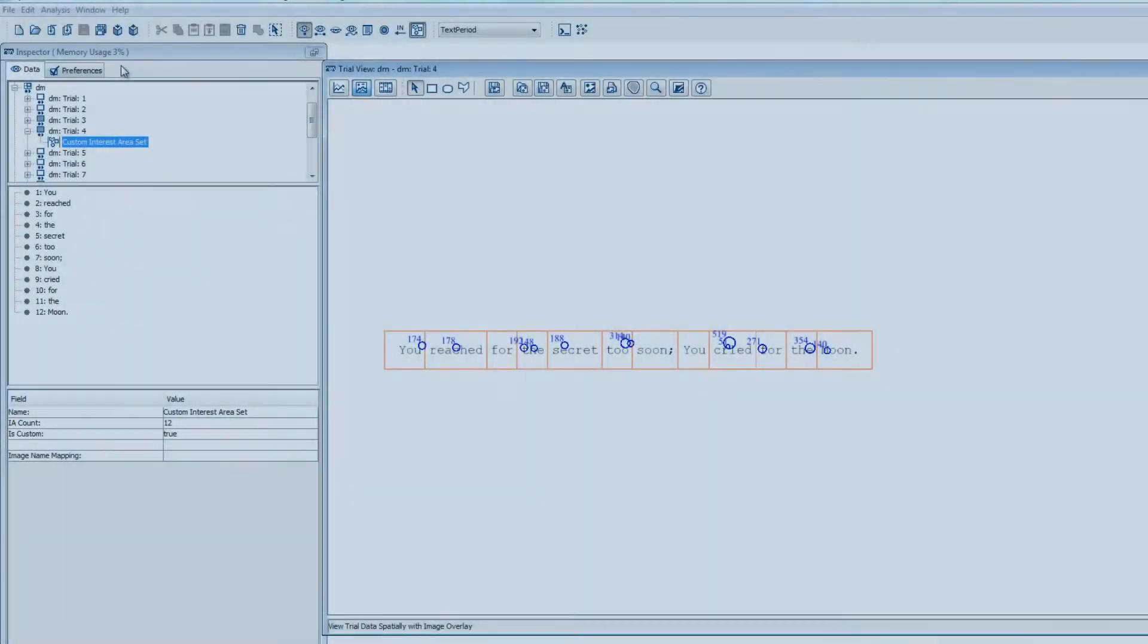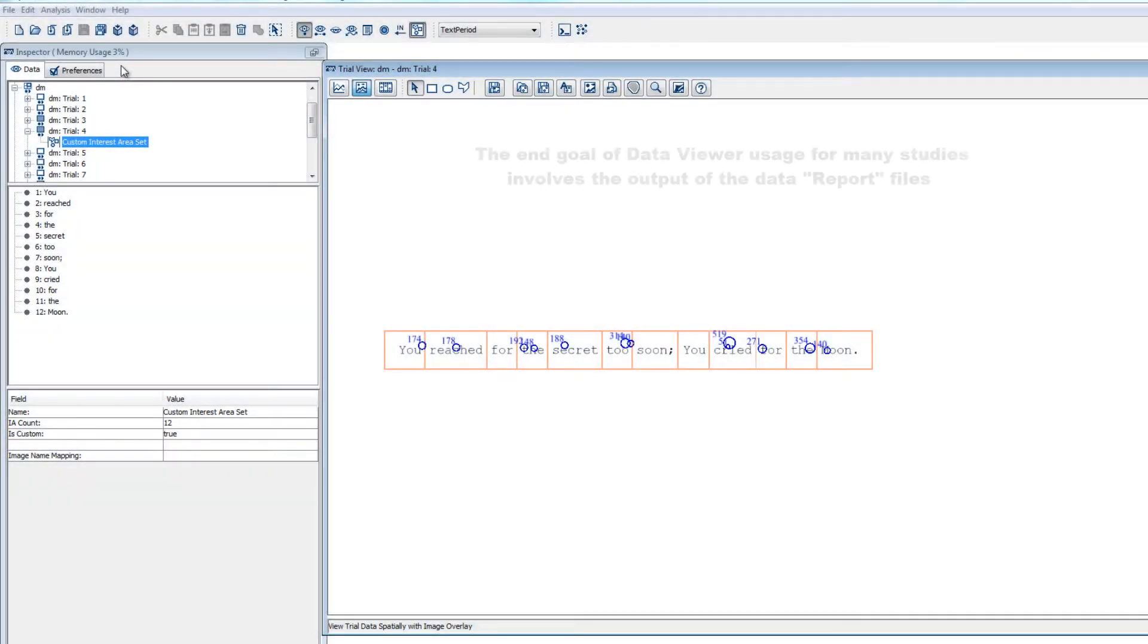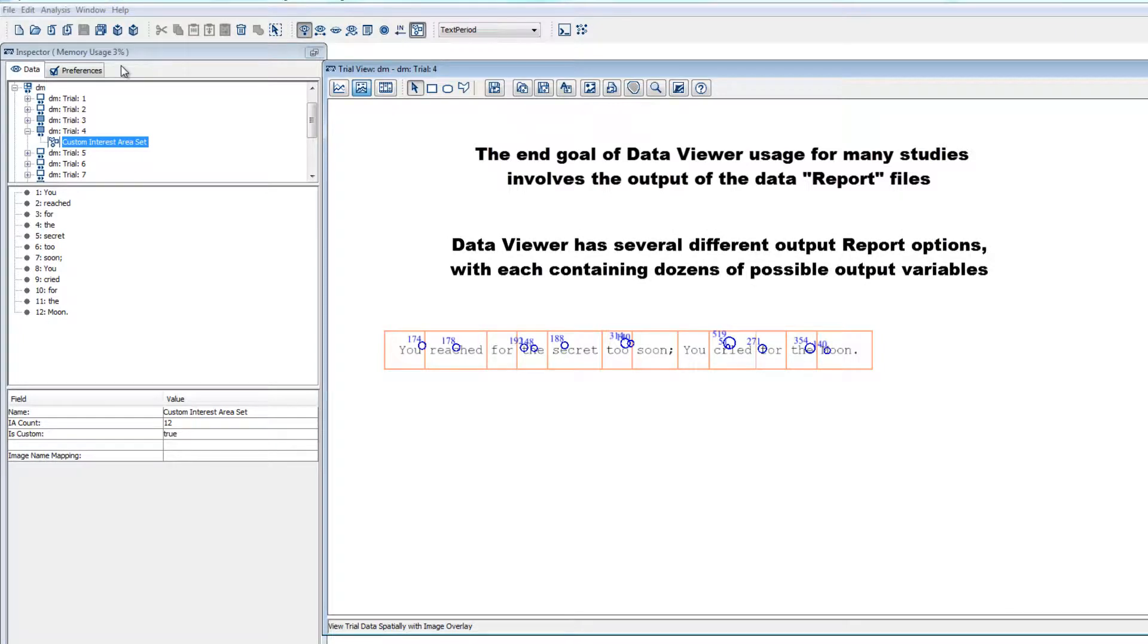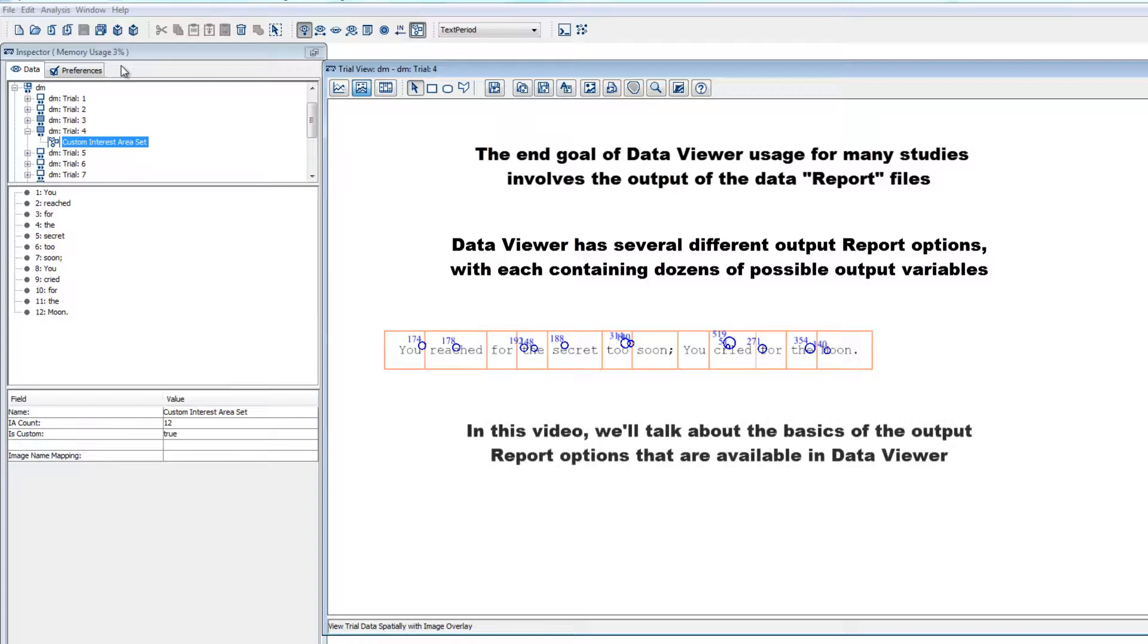The end goal of Data Viewer usage for most research studies involves the output of the actual data files. Data Viewer has several output report options, each containing dozens of possible variables that can be included. In this video, we'll cover the basics of reports and the organizing principles underlying them.